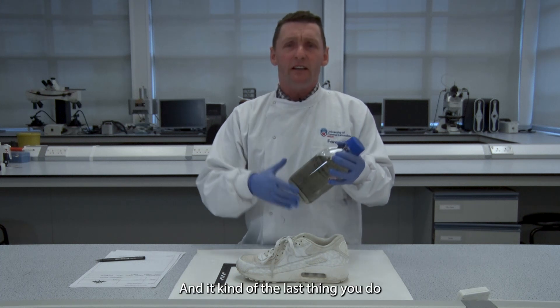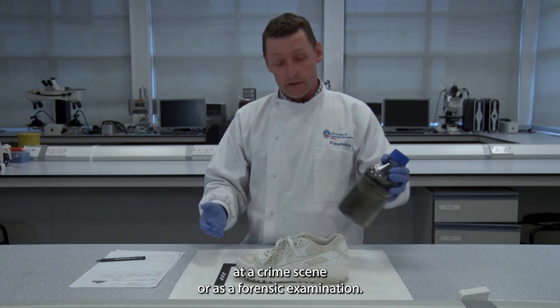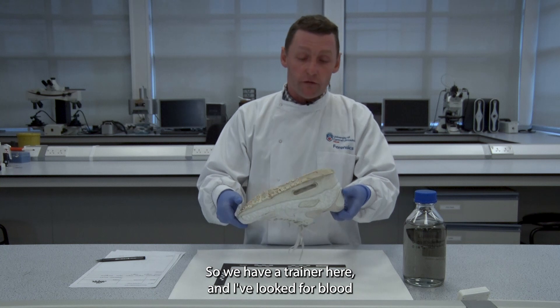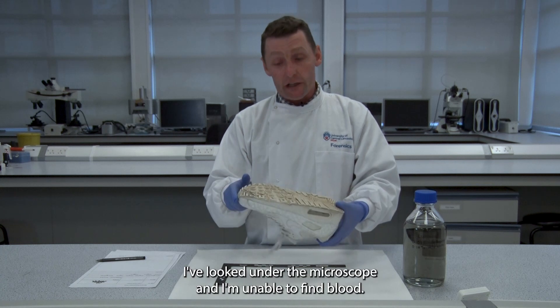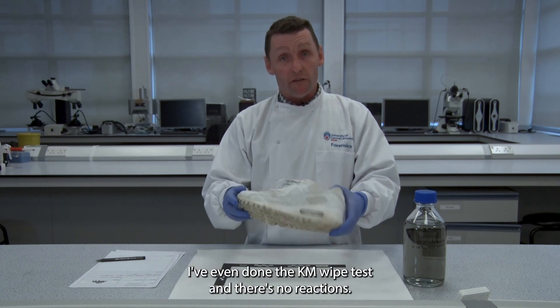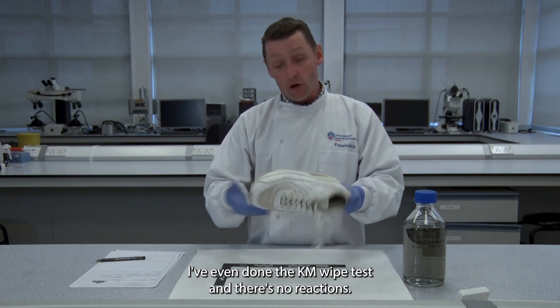Luminol is the last thing you do at a crime scene or forensic examination. We have a trainer here and I've looked for blood using the KM test in a previous tutorial. I've looked under the microscope and I'm unable to find blood. I've also done the KM wipe test and there's no reaction.